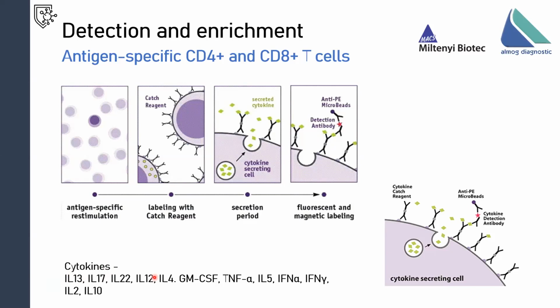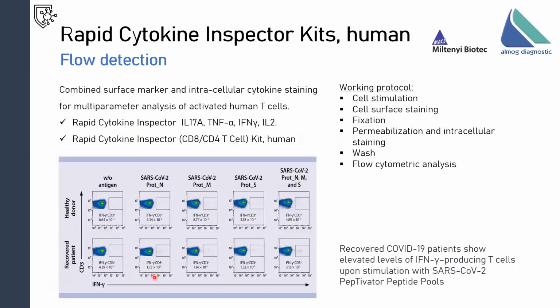Now, I want to highlight the uniqueness of this procedure. The entire procedure is a labeling of cell surface markers and a cell surface secreted cytokine.